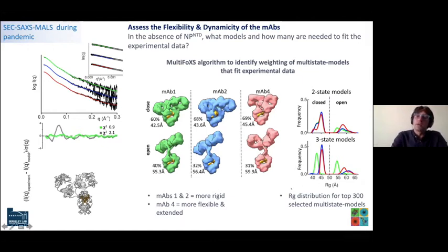So we also tried to calculate some histograms. All these tools are available. And what we found out is that there are antibodies that are very rigid or very flexible. And now we had the question of how we can couple those antibodies to improve the detection signal for detecting the nucleocapsid. What is the main target for rapid tests?